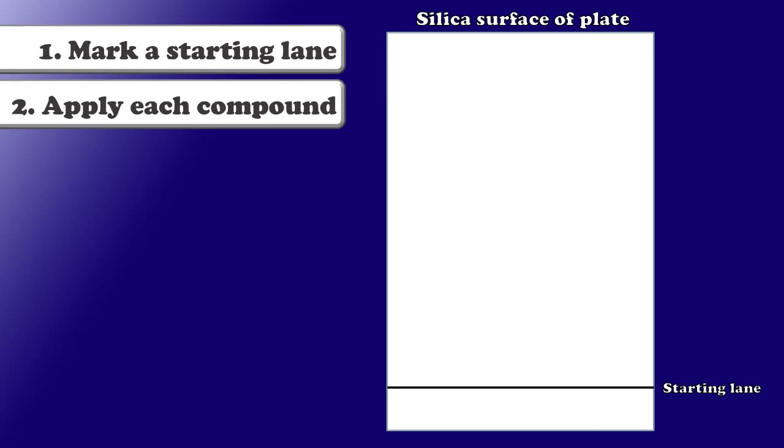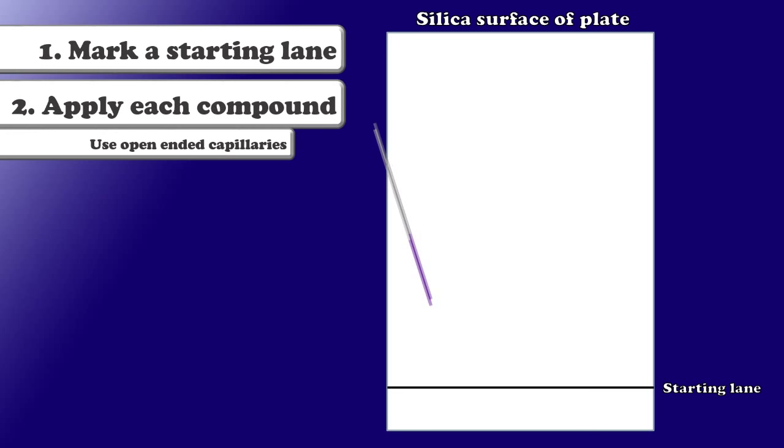The next step in the process is to apply our compounds to the plate. Now, this is often done using small glass capillaries, which we can fill with solutions of our compounds in a volatile solvent, such as methanol. We use open-ended capillaries so that we can draw the liquid in through capillary action and also expel it from the capillary simply by touching it to the surface of the silica plate. So I'm going to spot one compound here on the left side of my plate.